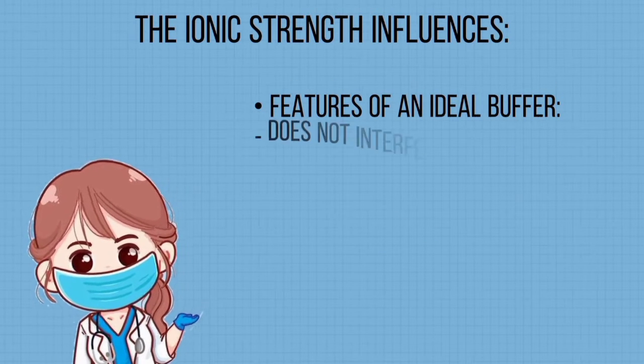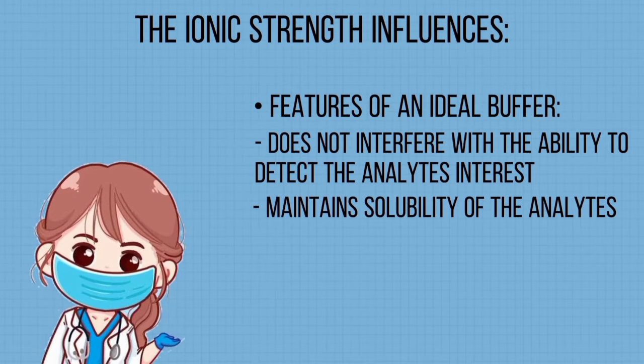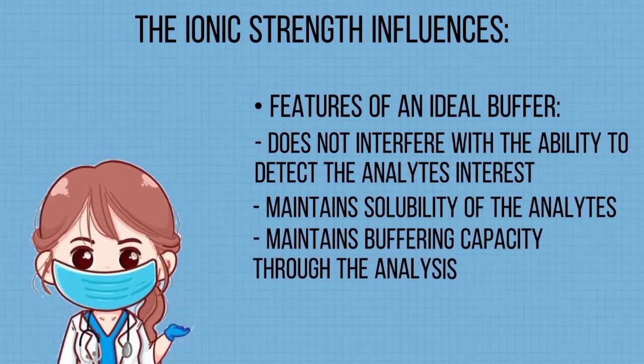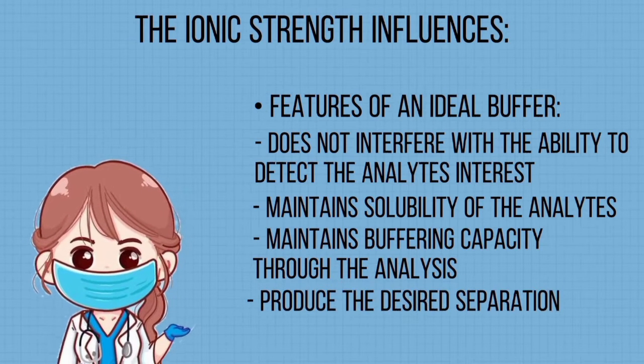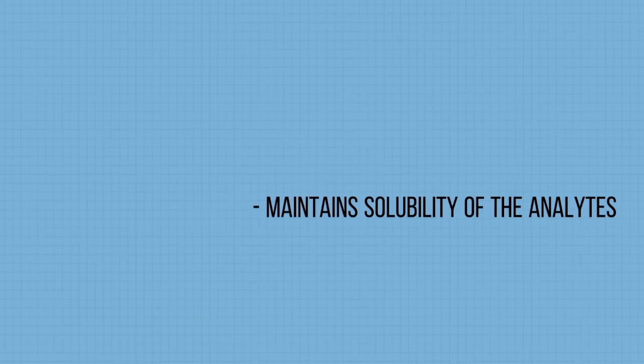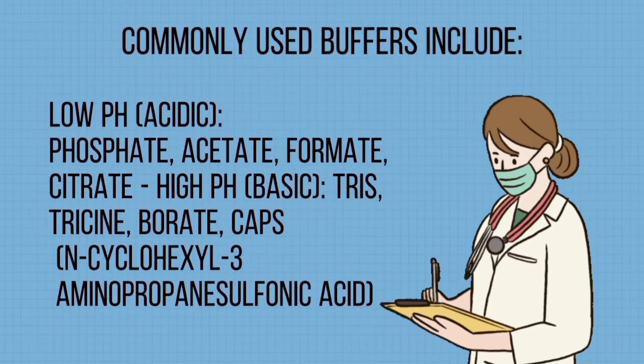Features of an ideal buffer: does not interfere with the ability to detect the analyte of interest, maintains solubility of the analytes, maintains buffering capacity throughout the analysis, and produces the desired separation. Commonly used buffers include low pH or acidic.